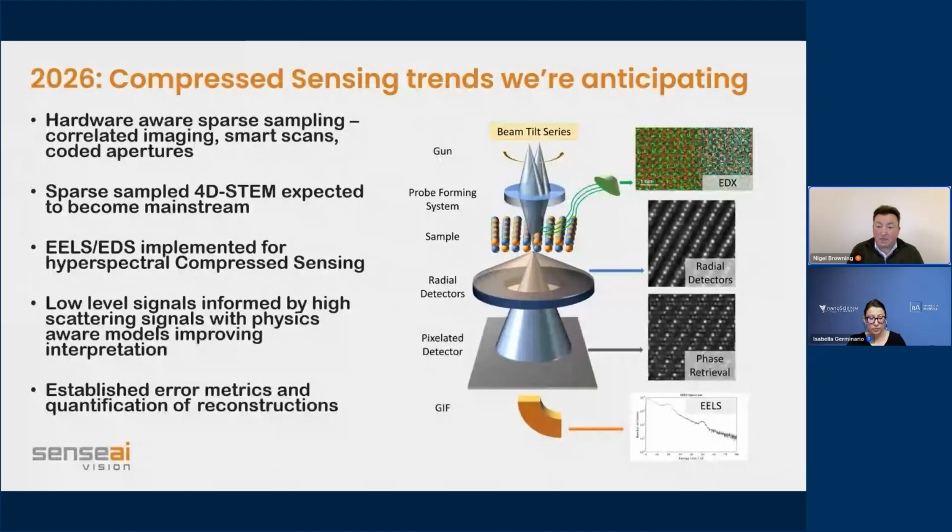If you're doing an SEM type experiment, you could use a secondary electron image to reconstruct your EDS or your EBSD map if you're trying to do something over a large area very quickly. So those interactions that are also related through to physical models of what the sample will be would allow you to get to the point of really getting high resolution images from a lot of different analytical techniques.